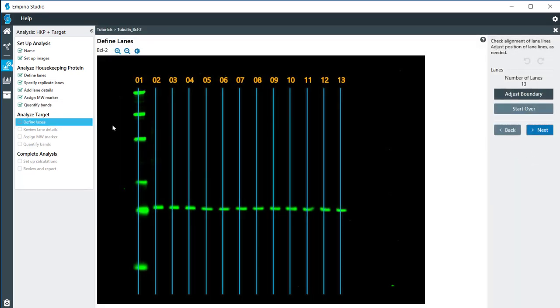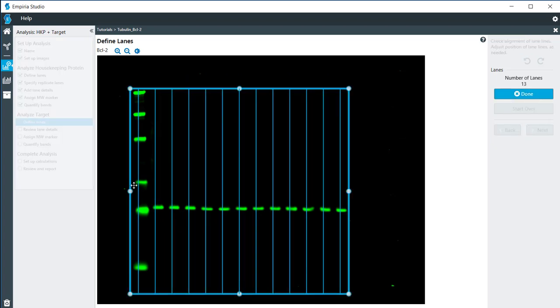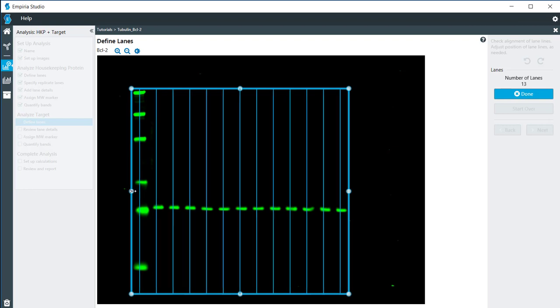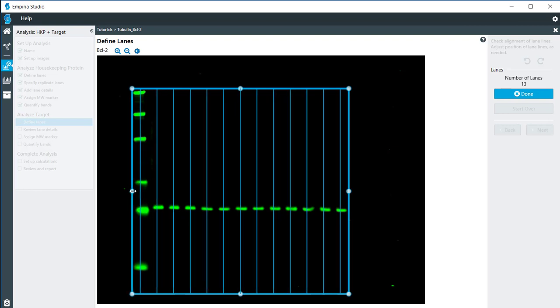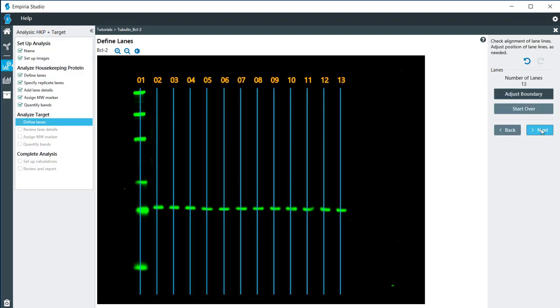Now for my target protein, everything looks pretty much the way it's supposed to. I'm going to adjust the boundary just slightly, right there. Click done, and then next.